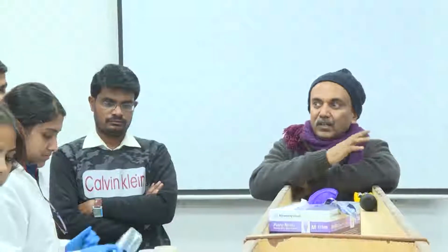5, 6 genera you wanted to quantify from a particular sample. So you need to dilute, prepare at least 6, 7 different media. 6 means 6 media you have to prepare and incubate them in a particular condition, maybe high temperature, low temperature, with oxygen, without oxygen, with light, without light. So you need to have different environmental incubation conditions also for certain groups of organisms.